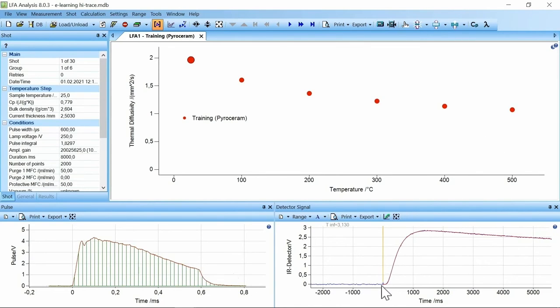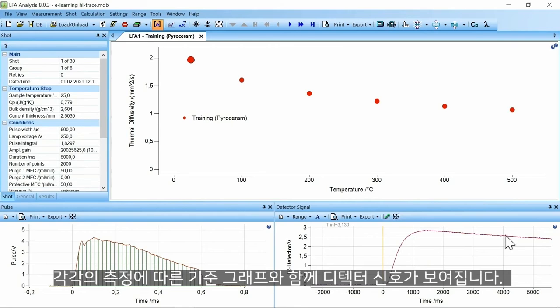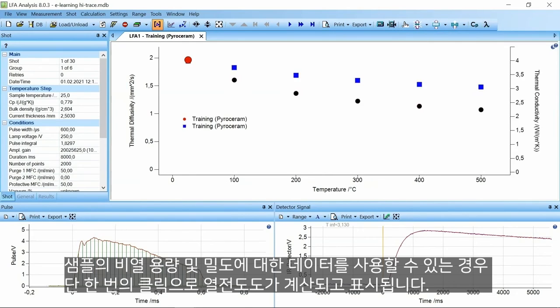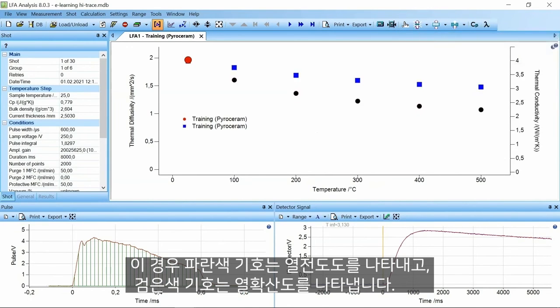For each shot, the detector signal with the corresponding fit is visible. If data for specific heat capacity and density of the sample is available, the thermal conductivity is calculated and illustrated by just one click. The blue symbols represent the thermal conductivity and the black ones the thermal diffusivity.